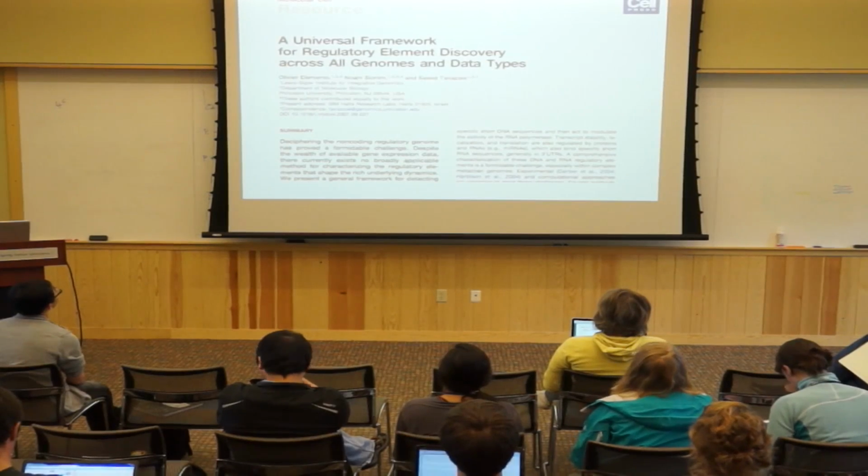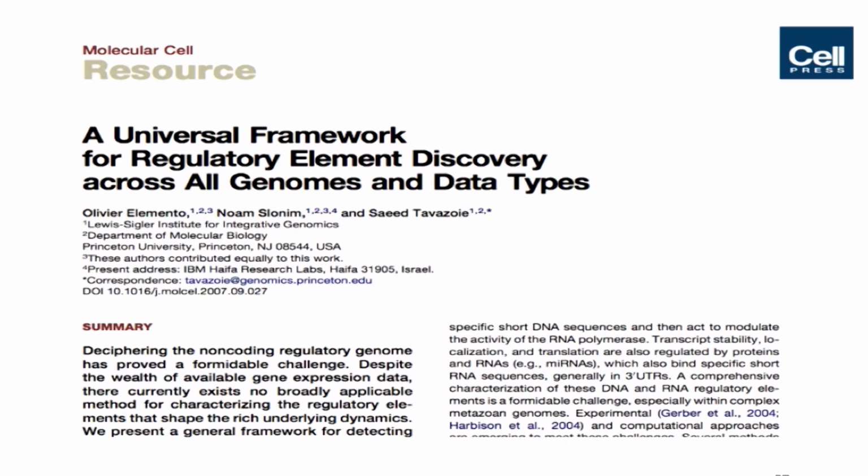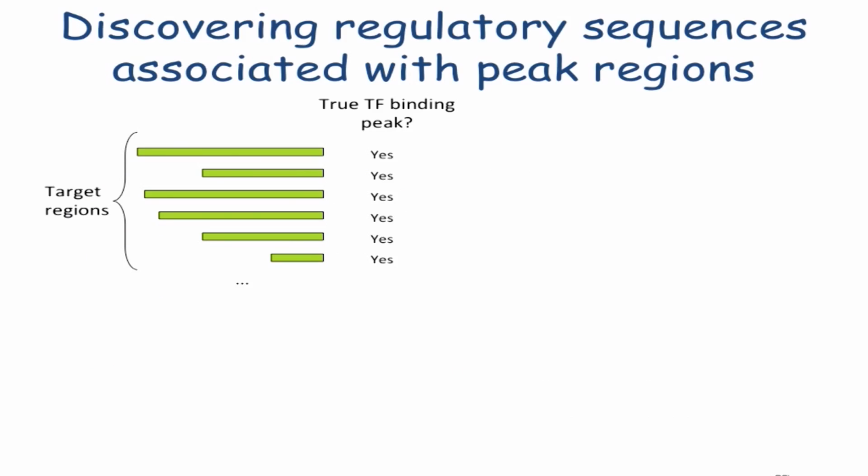I do want to tell you about one thing that we did a couple of years ago in terms of motif analysis. There's a paper we published in 2007 that is actually quite highly applicable to ChIP-seq motif analysis. This is a procedure for unbiased motif analysis, motif discovery. By unbiased, the de novo idea is that you're not using a database of motifs to do a motif analysis.